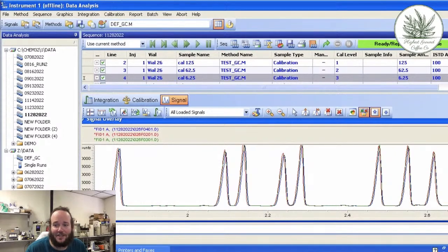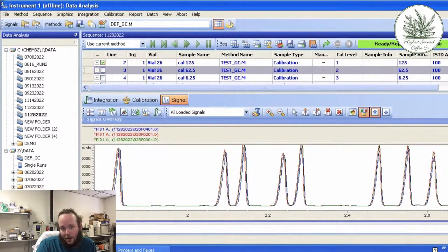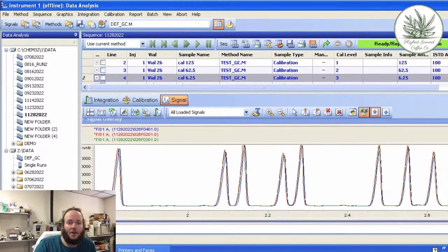Hey, old Scratch, good to see you. So there was no dilution in the calibrations, and what that means is that there's no breakdown. We can't see a 3-point run. It's basically a 1-point calibration, which is not in itself invalid, but it's not as useful, and it's not what we were specifically going for. So those were the calibration standards from the ResTech. That was the second sequence on it.